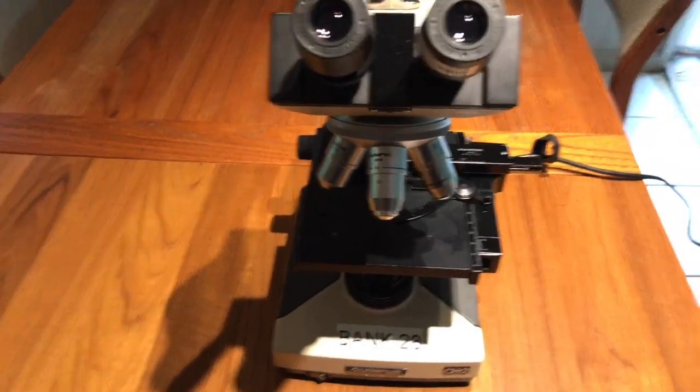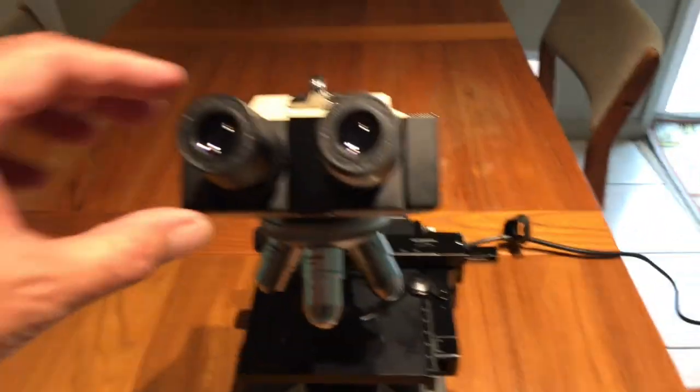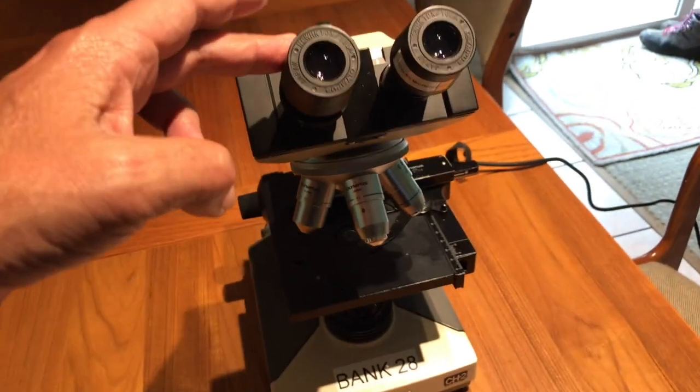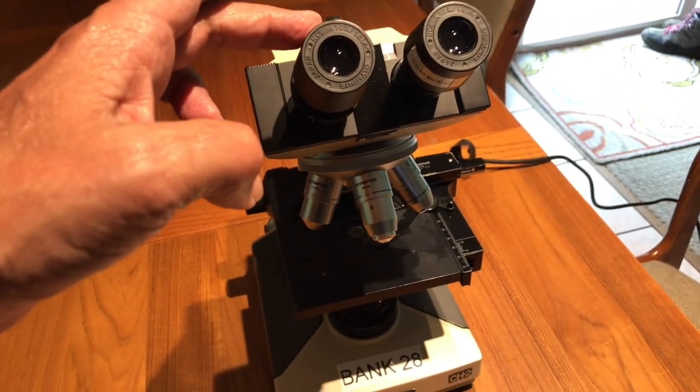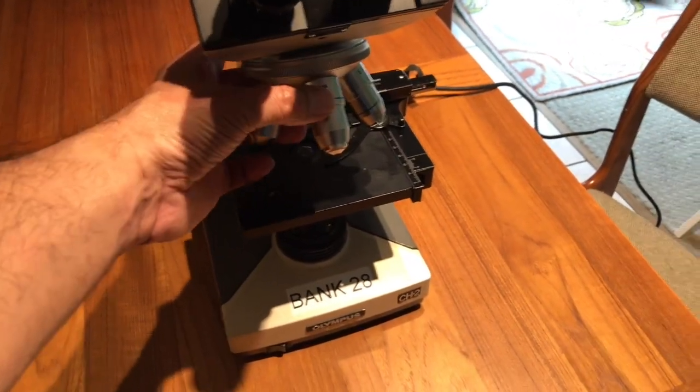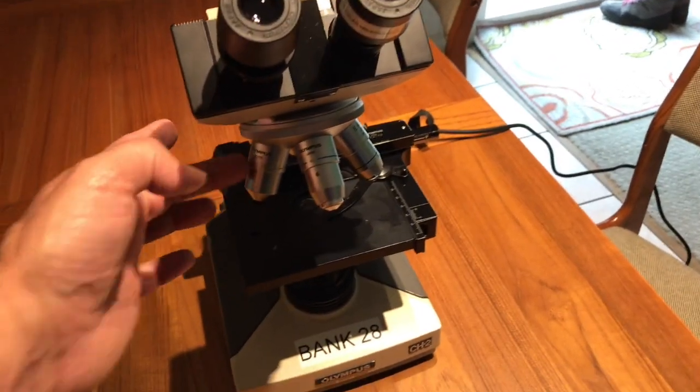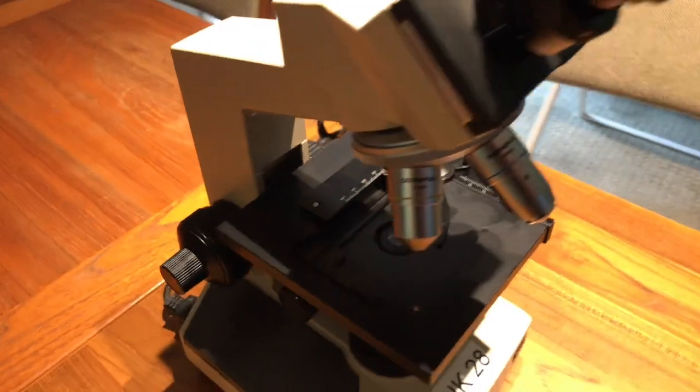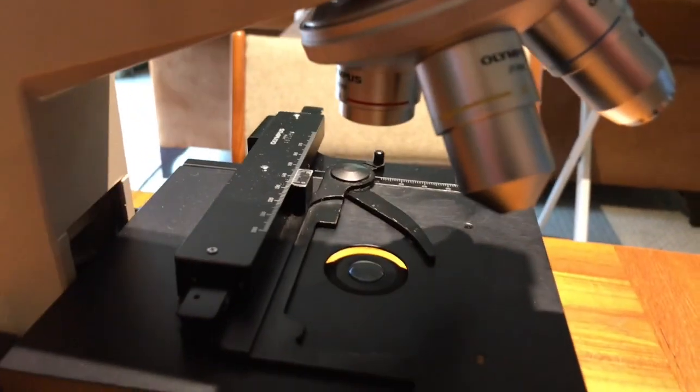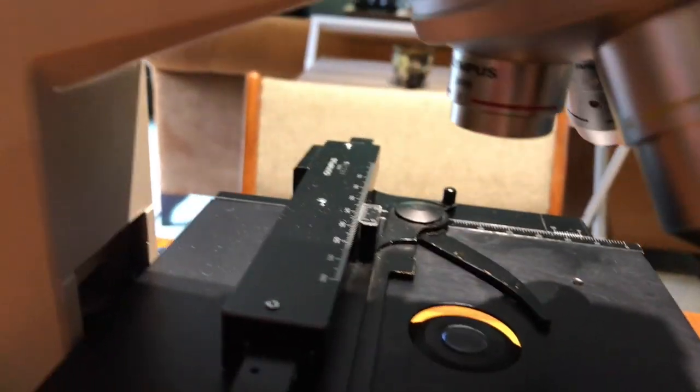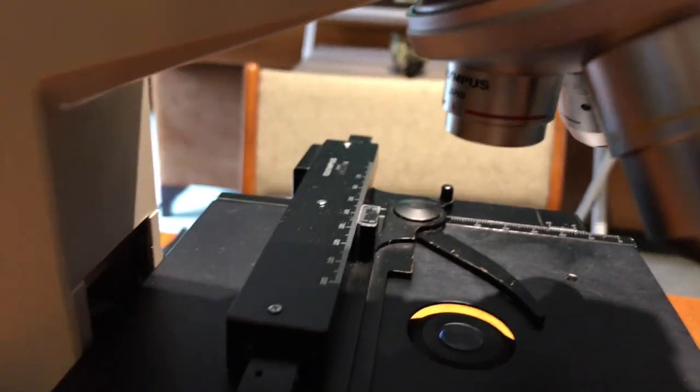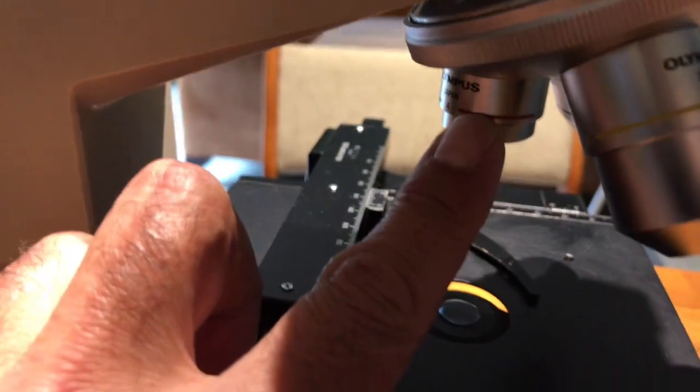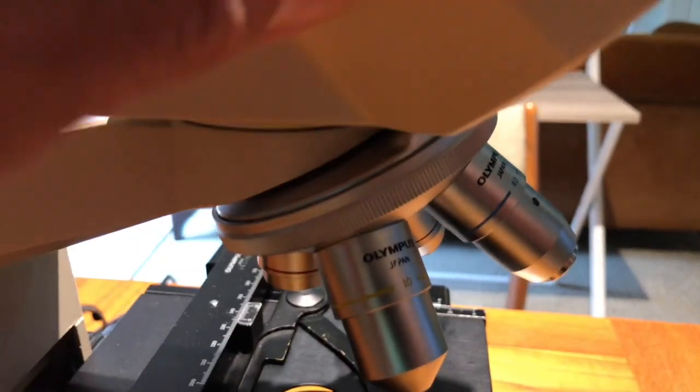The total magnification, you're going to figure that out by multiplying the magnification of the eyepieces times the magnification of your objective. So for example, right now I have selected the objective that is 4x with the red band, and so the total magnification is going to be 4 times 10, which is the magnification of the eyepieces, so that will be a total magnification of 40x.